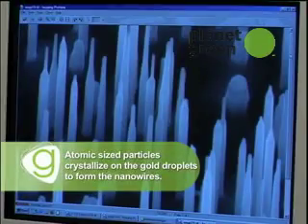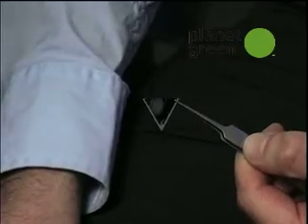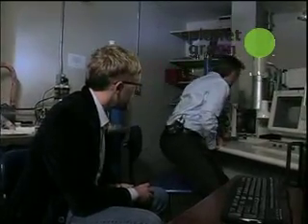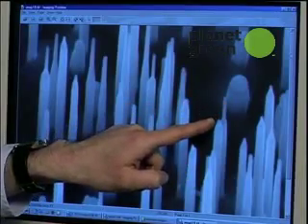After the piece of silicon comes out of the evaporator, how do you know it has nanowires on it? I have a piece here that has nanowires. If you compare with the surface we started with, which was shiny, you can see now the surface is completely black — like it's covered in soot. To confirm everything grew as expected, we use this electron microscope and can actually see individual nanowires. On the top of each nanowire, you can see a shiny piece of gold. The growth of the wire takes place underneath the gold, so as the wire grows, it pushes the gold out.